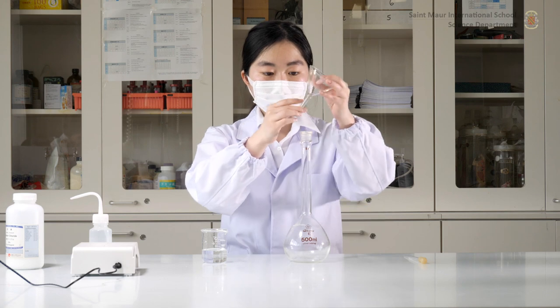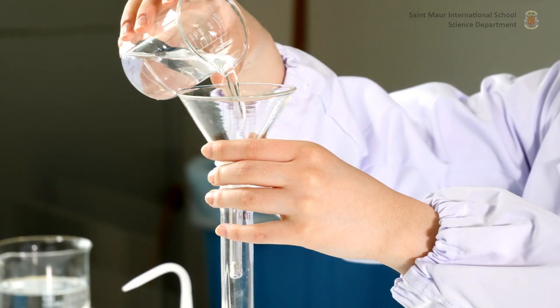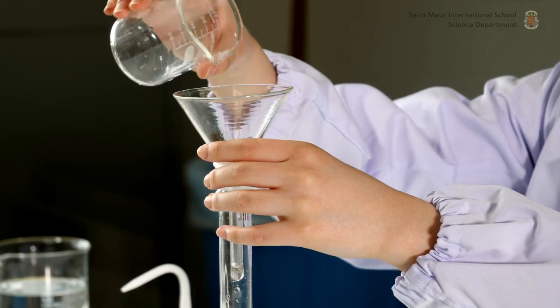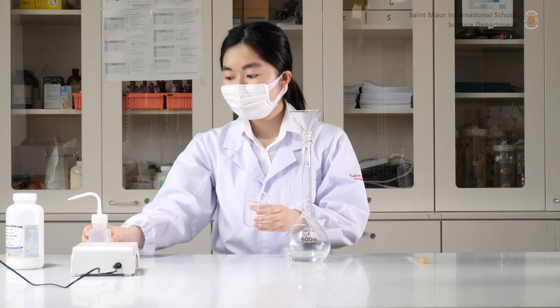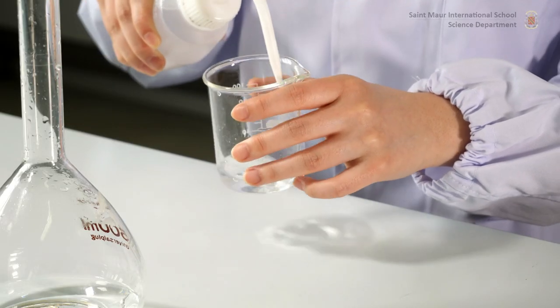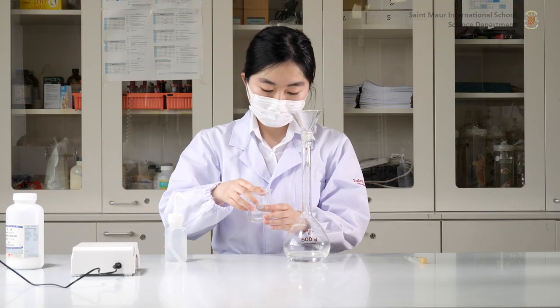Place a funnel at the mouth of a 500 milliliter volumetric flask and pour in the mixture from the beaker. Rinse the beaker with a small volume of distilled water and pour it into the funnel again, thus transferring the washings to avoid losses. Repeat twice.